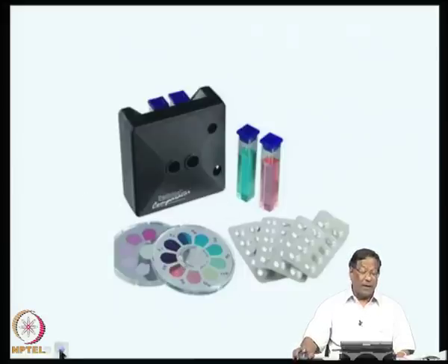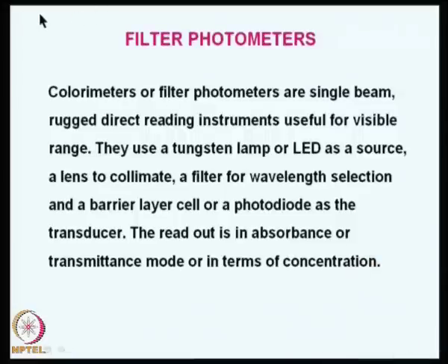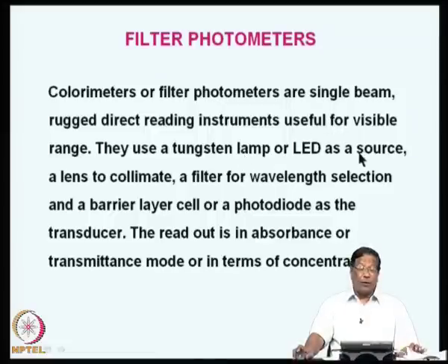These are color comparators. Now, the slightly higher end are colorimeters or filter photometers. These are essentially single beam rugged direct reading instruments useful for the visible range. They use a tungsten lamp or LED as a source, a lens to collimate, and a filter for wavelength selection. You do not use prisms or gratings for wavelength selection. Basically, it is a filter, and the detector is also only a barrier layer cell or a photodiode as the transducer, but not PMTs.